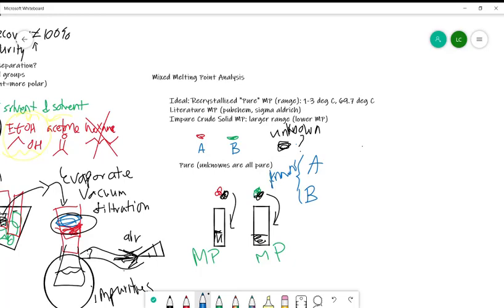I'm sorry if I say anything confusing. Let's say A had a melting point of like 69.7 to 70.2, I don't know.